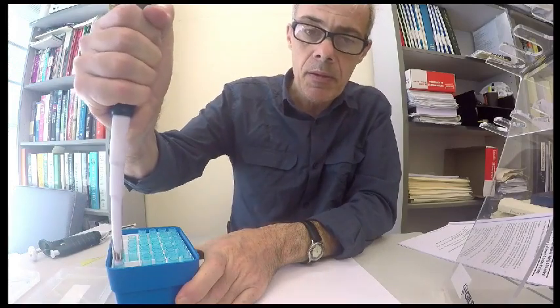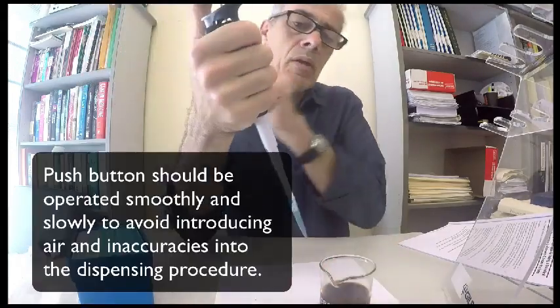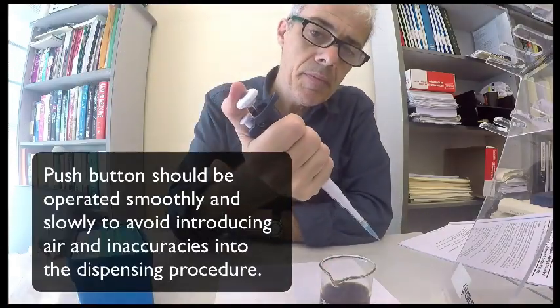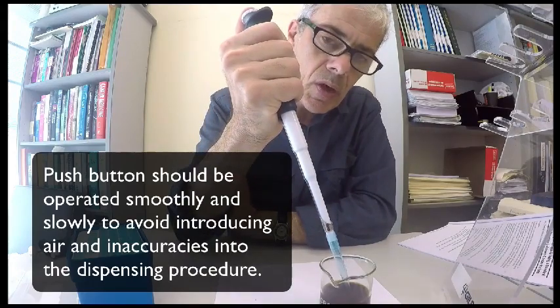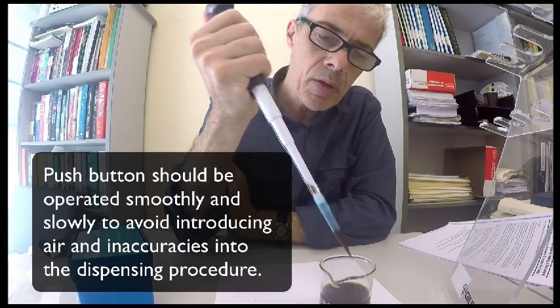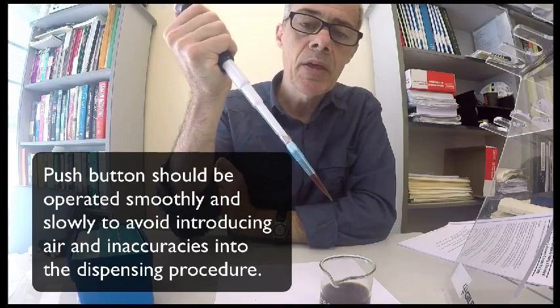Simply place your tip down to the first position here. Immerse. Slowly relieve the pressure on your thumb to draw up the 500 microliters.